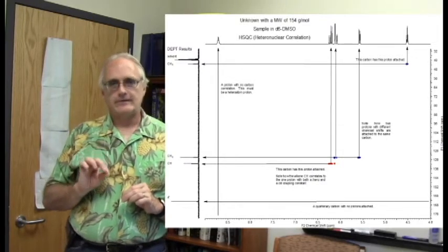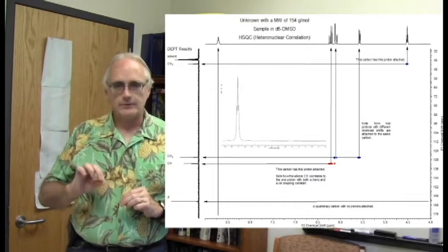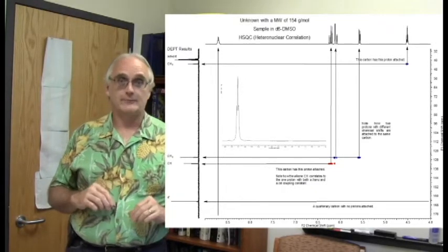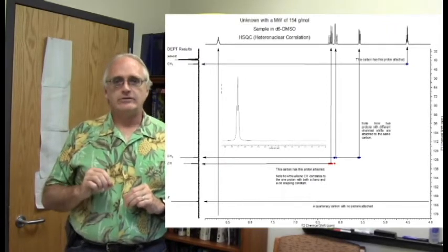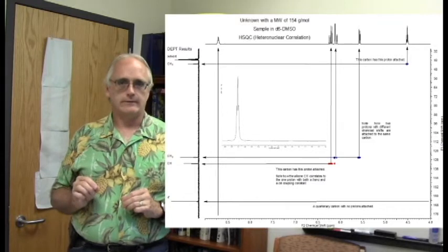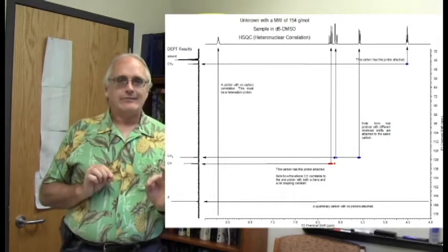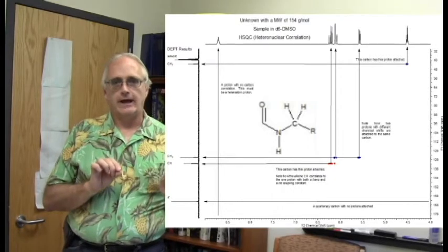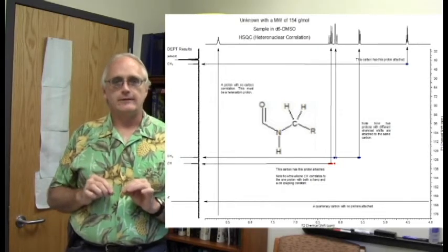The peak at 8.7 ppm in the proton spectrum is a triplet. It's coupled to the peak at 4.5. Our homonuclear decoupling experiment has already shown us that. In other words, the hydrogen on this heteroatom has 2 neighboring protons. So even if it's a hydrogen on a nitrogen, it has to be 1 hydrogen on a nitrogen, because the nitrogen is connected back here to the carbonyl and then to a CH2 group to give the triplet.